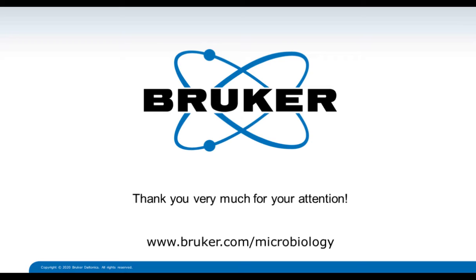Wonderful. Thank you so much. I know there were a couple of parts to that question, so we'll move on to our next one. Are the subtyping results also contained in the LIMS export? The multi-parameter subtyping. Yes, indeed. That is also now part of the export to the laboratory information system.